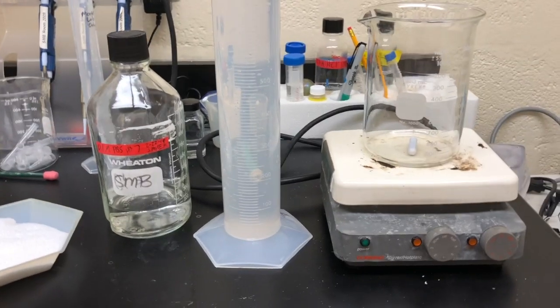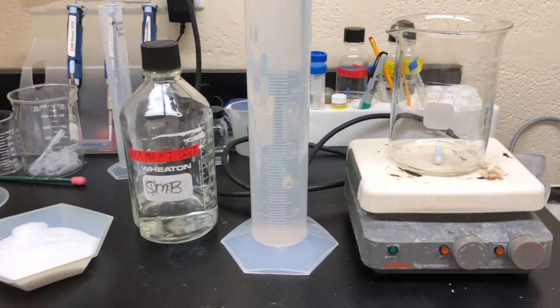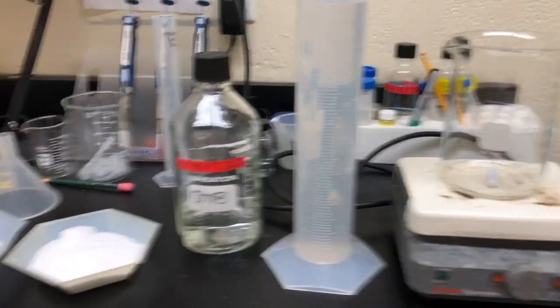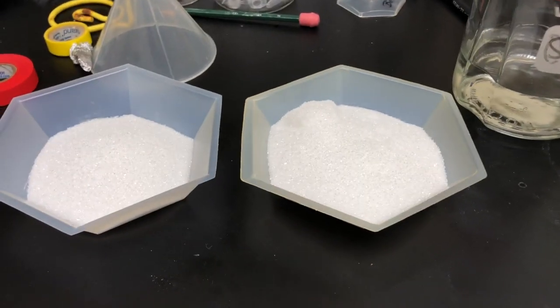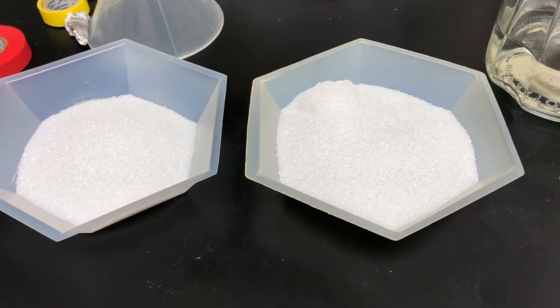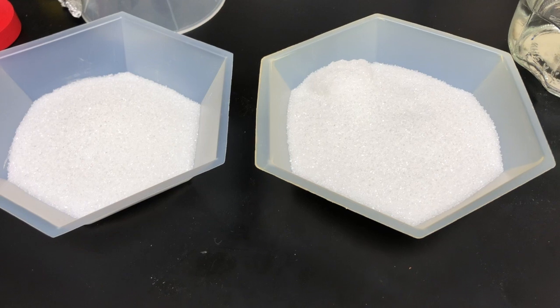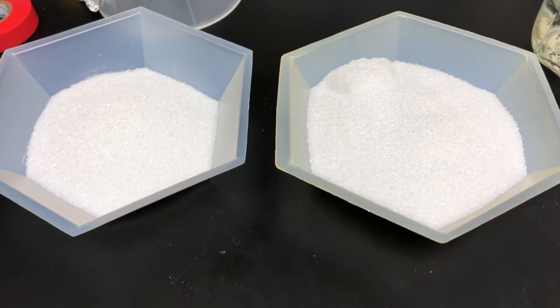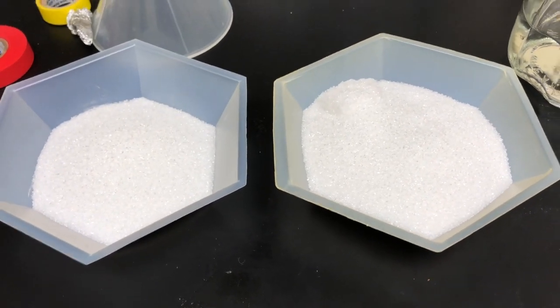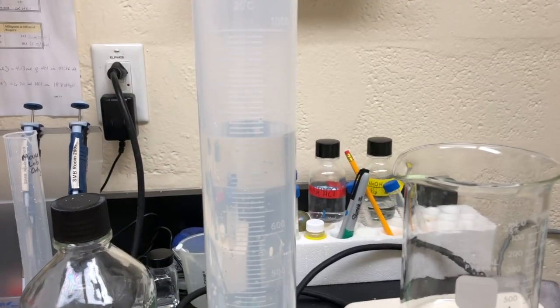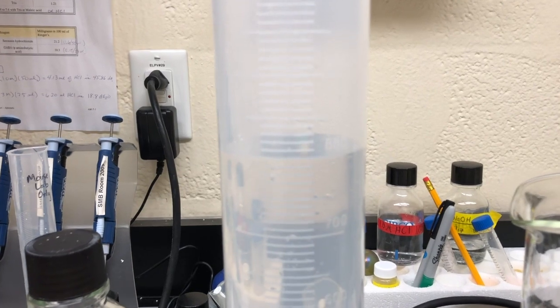Hello everyone, today I'm going to show you how to make 30% sucrose in 0.1 molar PBS. First, you want to weigh out 300 grams of sucrose in two containers. Weigh both because the scale only goes up to 200 grams, so you want to do another one with 100 grams. Then you want to measure out 800 ml of 0.1 molar PBS at eye level in a graduated cylinder.